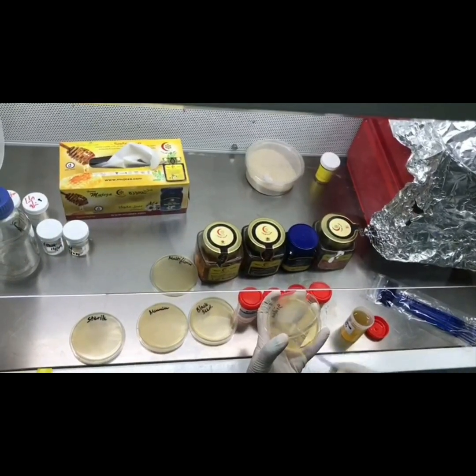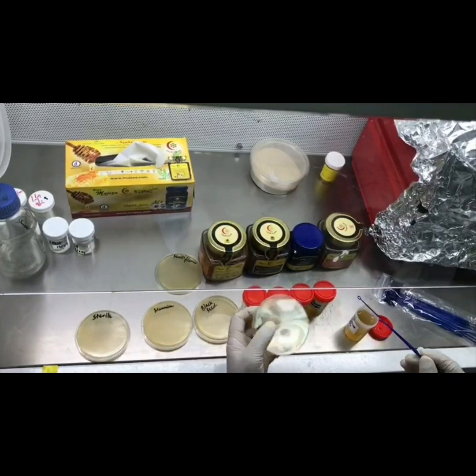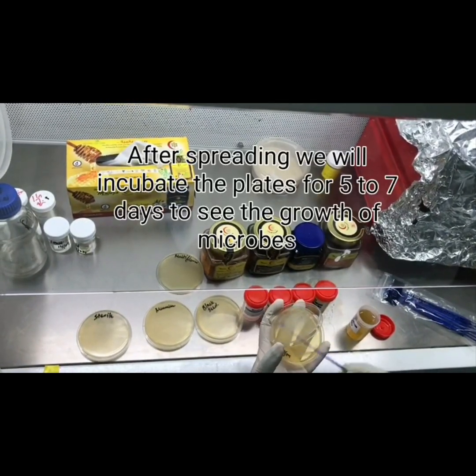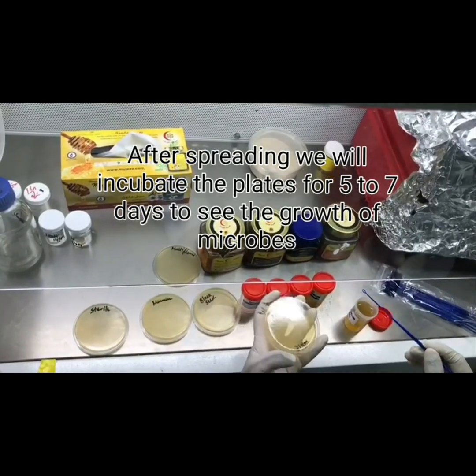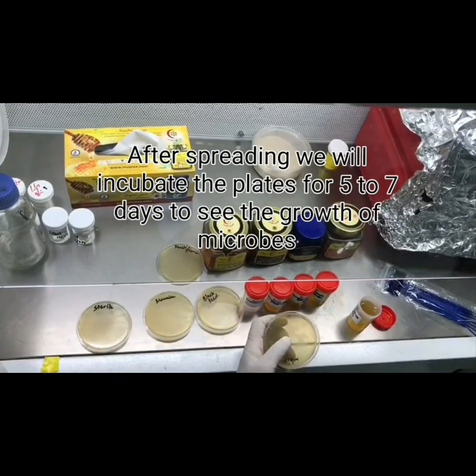Likewise I will transfer all and we will see how effective our Sidr honey, black cumin honey, and wild flower honey are in killing these molds and yeast.